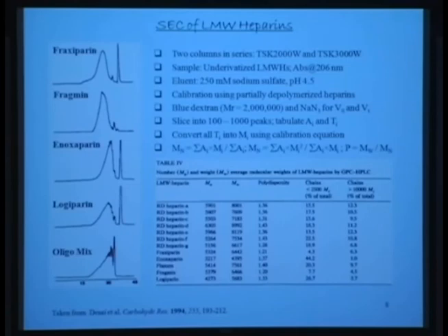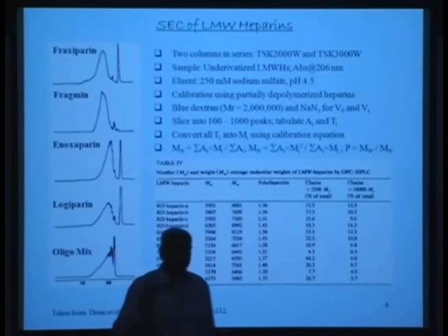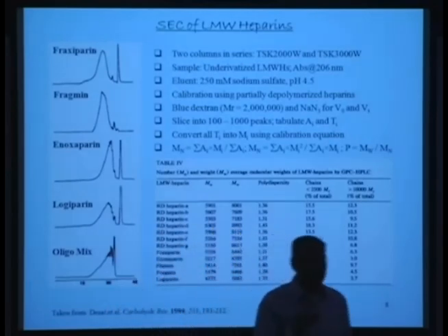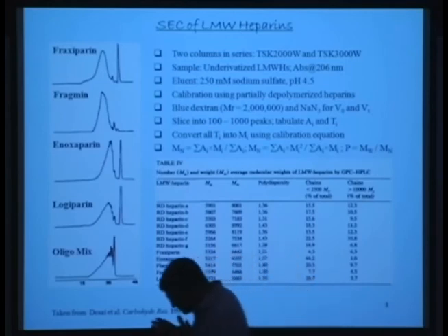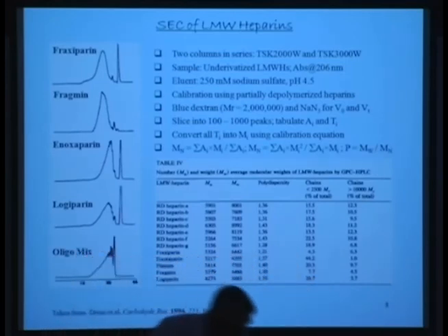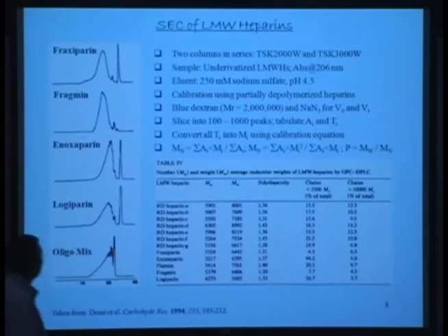What is Mn and Mw? So Mn is the number average molecular weight. So obviously the formula is written here, but I'll give you a simple explanation. Can you give a physical sense? Yeah, I'll give you a physical one, and I think for you all it's important to understand the physical basis as to what this is. So number average molecular weight is in essence, the A here stands for absorbance, but in actual sense A here corresponds to the number of chains.